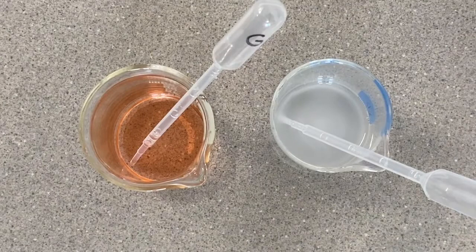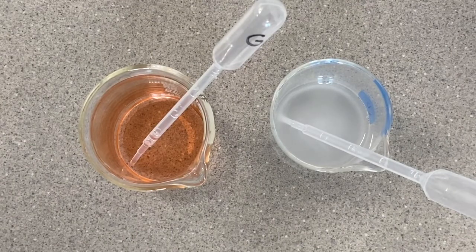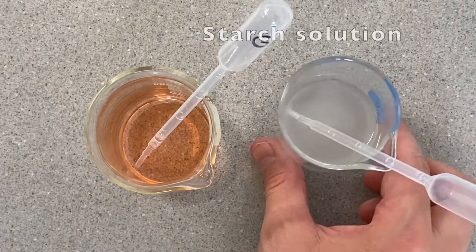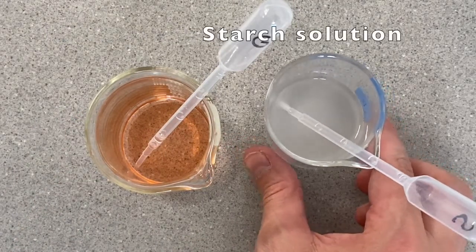Our next step in this lab is to fill each one of our cell models with a different solution. This orangey one here is a glucose solution and this cloudy white one is a starch solution.